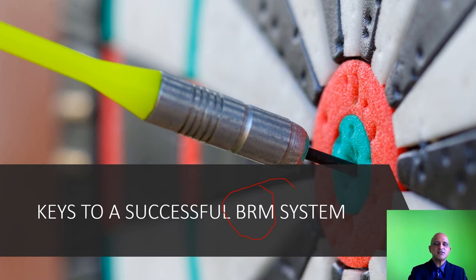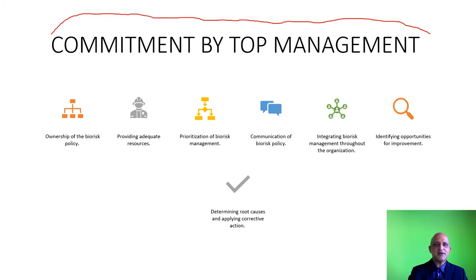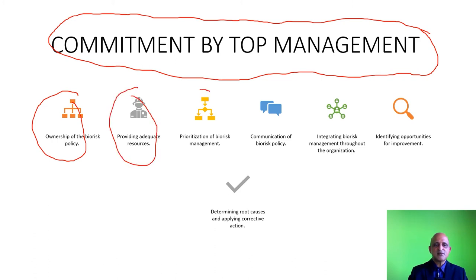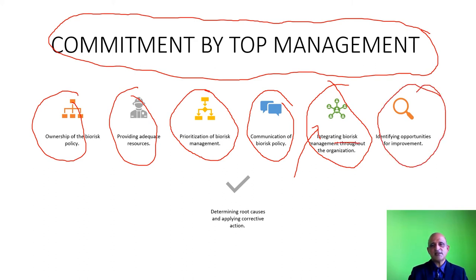What are the keys to a successful Biorisk Management System? The first key is commitment by top management. Top management must take ownership of the system, provide adequate resources, give safety a priority over science, communicate the Biorisk Policy across the organization, integrate Biorisk Management throughout the organization, identify opportunities for improvement, and define the root cause and apply corrective action.